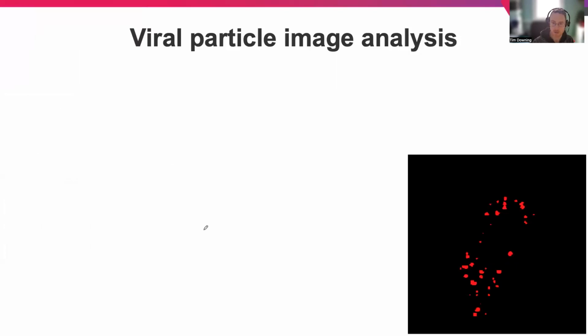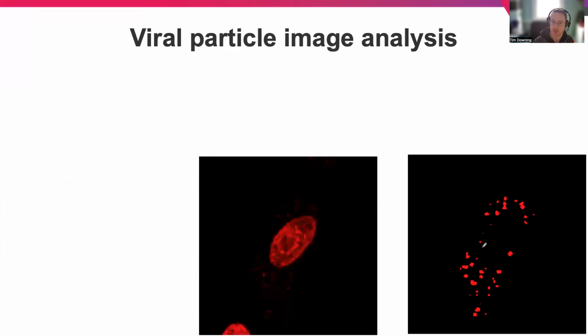So we'll look at images like this on our right, where we're looking at the number of virus particles or virus factories that are present, and then also the numbers of host cells on two different linked images.